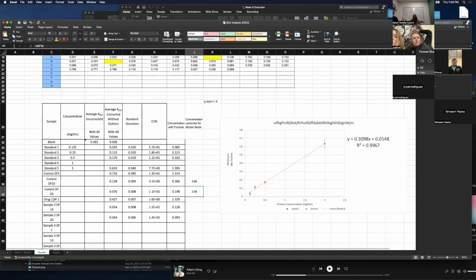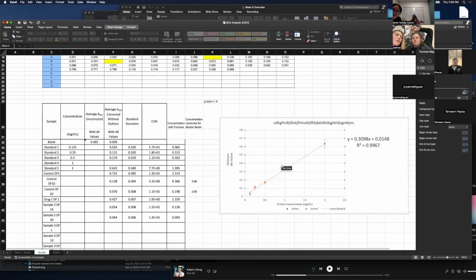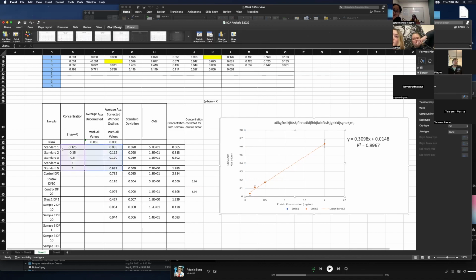Okay, and then I also was wondering, we didn't have our values put in first, but we were going through the motions. Will our graph correct, or will we have to redo our graph? So if your graph... no, it didn't. The graph is set up to pick up data if it has these standing boxes, basically. Basically, anytime you change numbers, your graph will auto update.